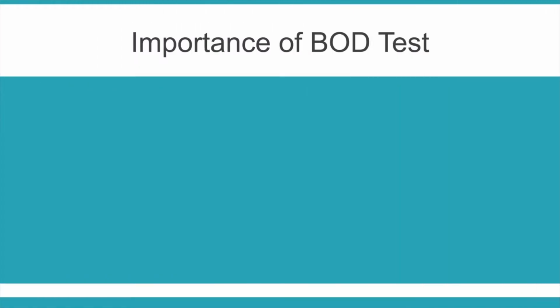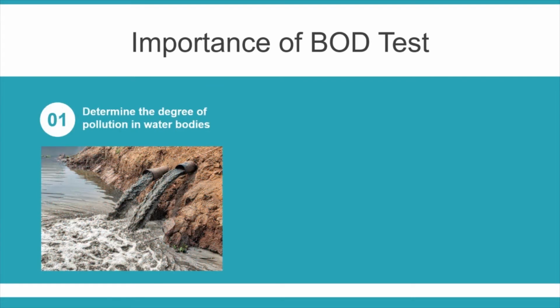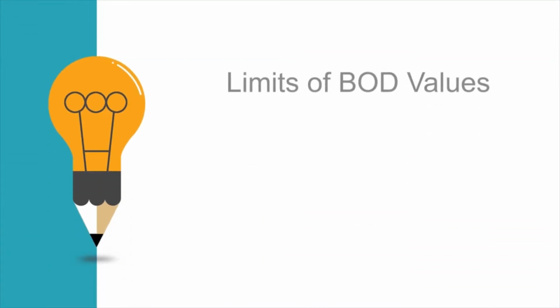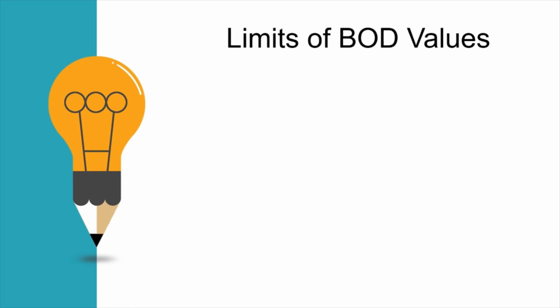Well, BOD test is very important. It can help us to determine the degree of pollution in water bodies and also the efficiency of water treatment plants. In fact, the BOD value of the industrial effluent discharge in Malaysia has been limited to some values.